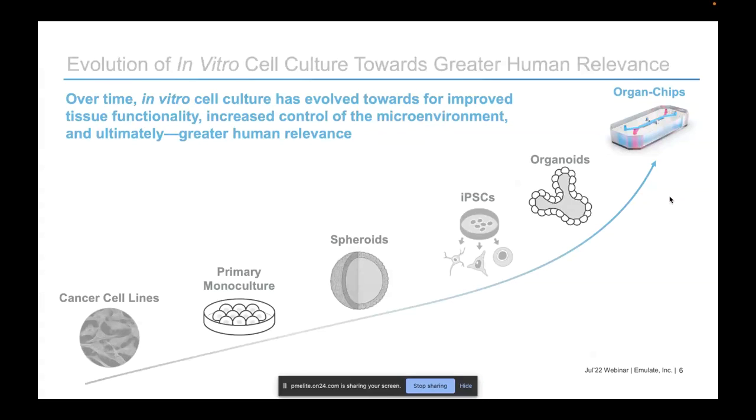Organoids, another step change here. So in here we're starting to talk about a heterogeneous and complex set of cell-to-cell interactions that are starting to take place. Organoids can be derived from primary biopsies and then propagated in vitro, and they contain a stem cell population that's able to continually replenish that heterogeneity, that cell source. They can also be derived from iPSCs. But they're another step change here, because not only are we starting to model microenvironment, but we're starting to add more complexity, more cell-to-cell interaction here.